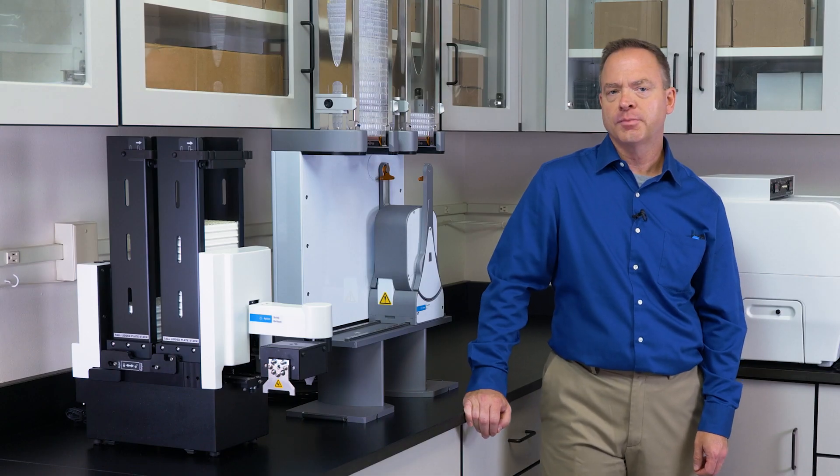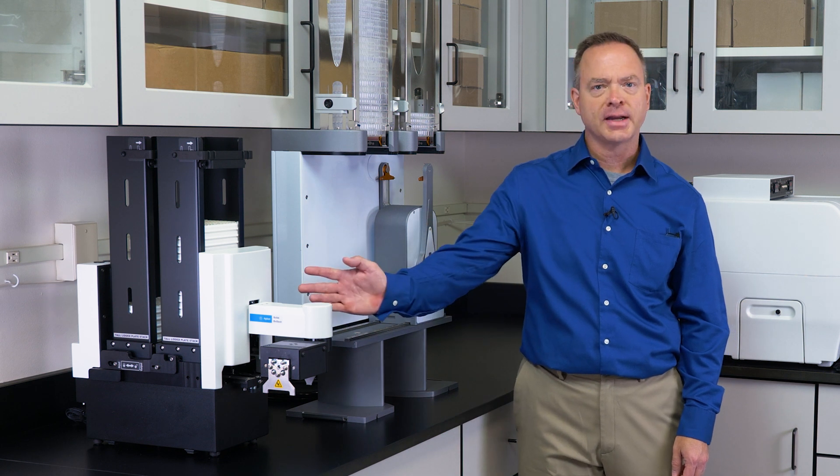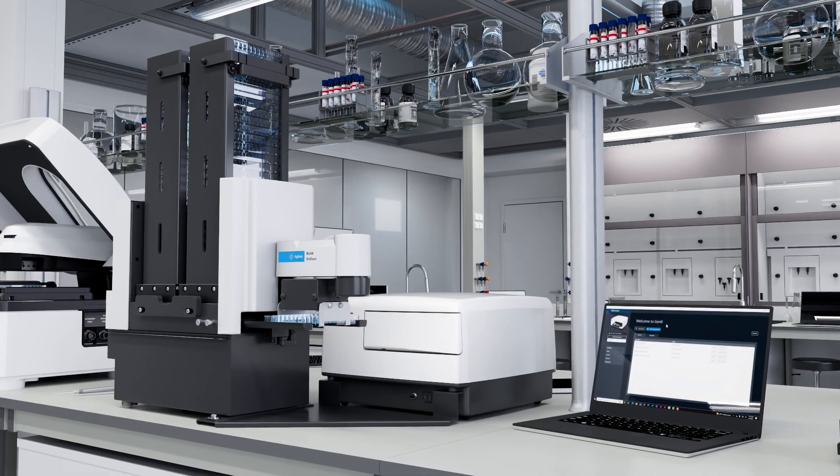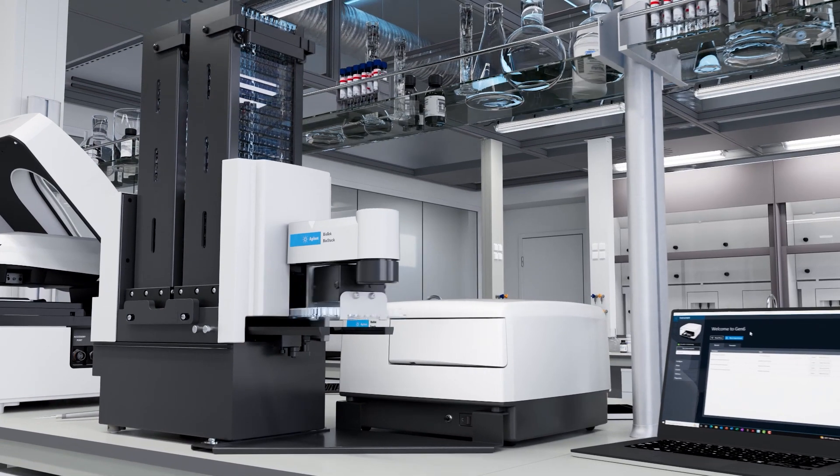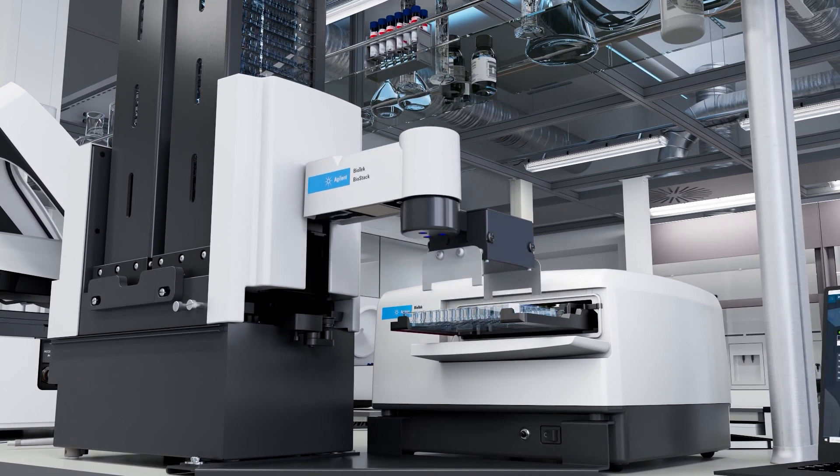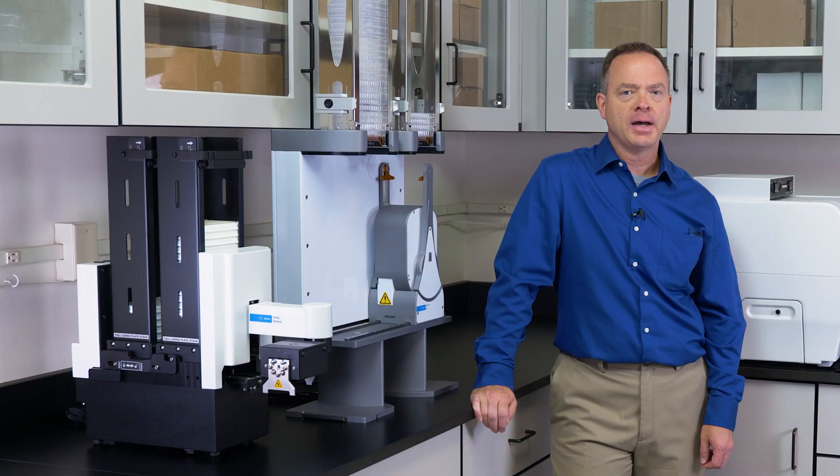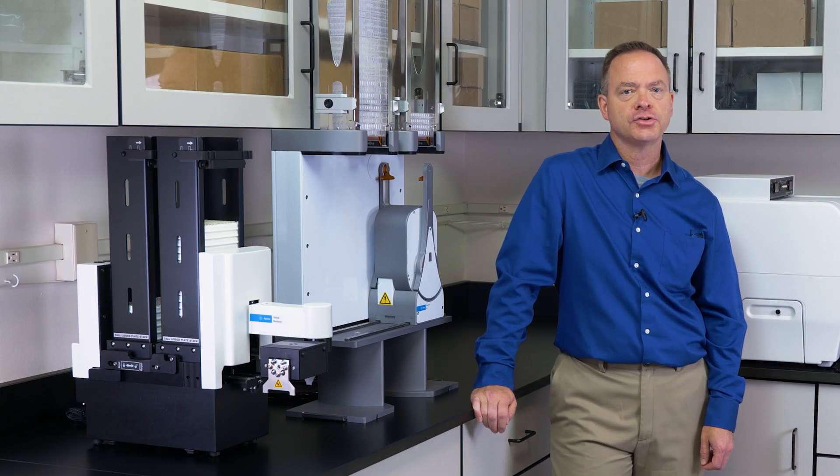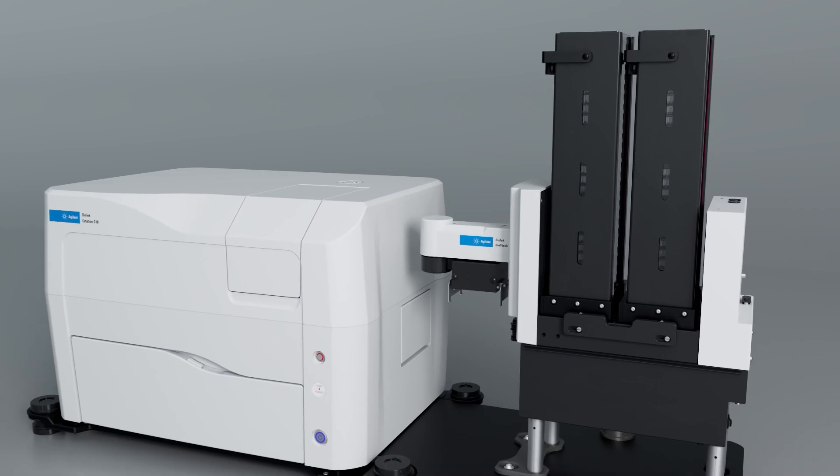The first instrument that I'm going to cover is the BioStack Microplate Stacker. The BioStack is a compact and versatile Microplate Stacker compatible with Agilent Biotech washers, dispensers, plate readers, and imaging systems.